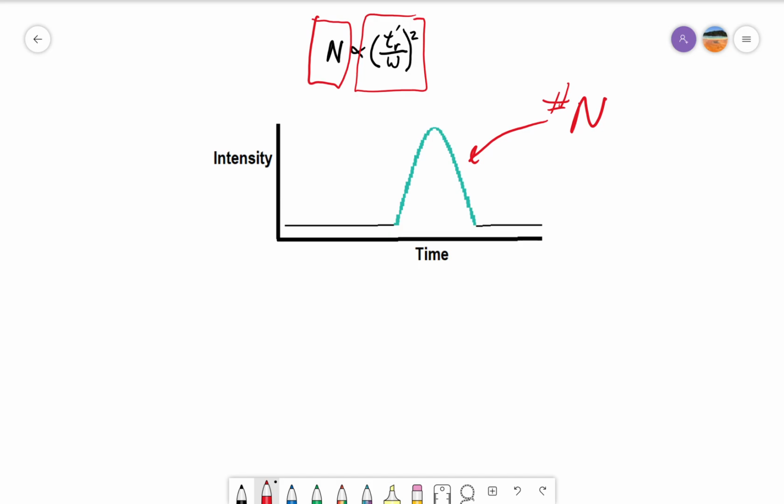Remember that the peak is a function of the resolution, the width and the time, and that's directly dependent upon n, the number of equilibria. Sometimes measuring the width of a peak is hard, but we can do it statistically because we already know that in a Gaussian distribution, most of the peak is occupied in 4 sigmas.